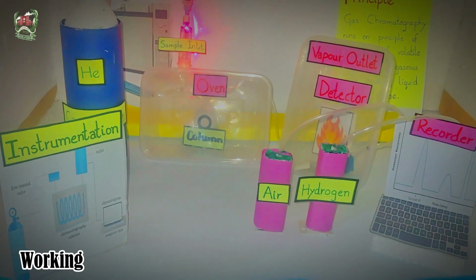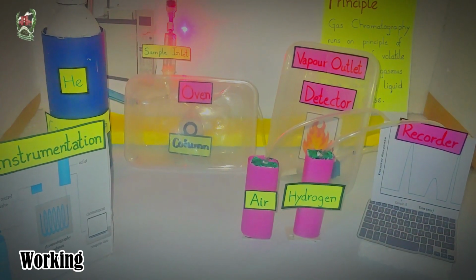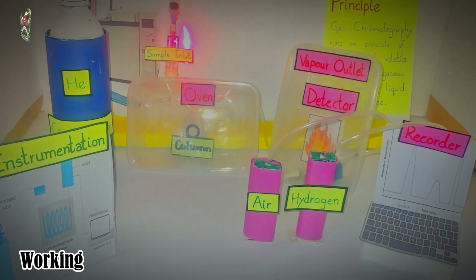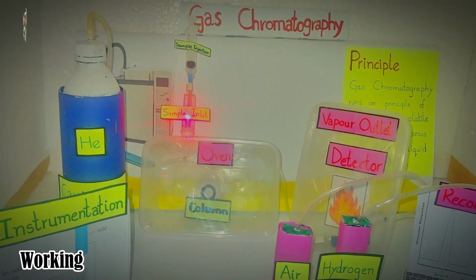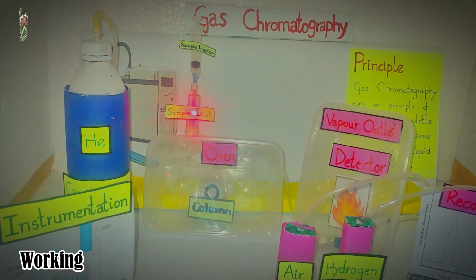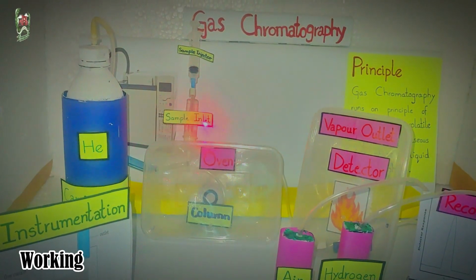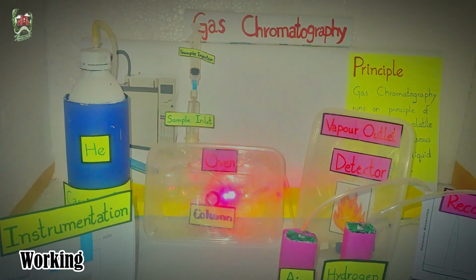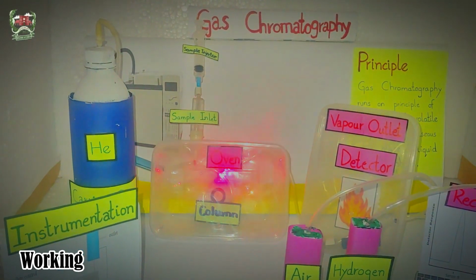If the sample is gas, then the gas syringe will be used. If the sample is solid, then it will be dissolved in a suitable liquid and converted into the liquid sample. If the sample is liquid, then we will inject the sample through the micro syringe at the sample inlet. If the gas sample is injected, then it will directly go towards the column along with the mobile phase.